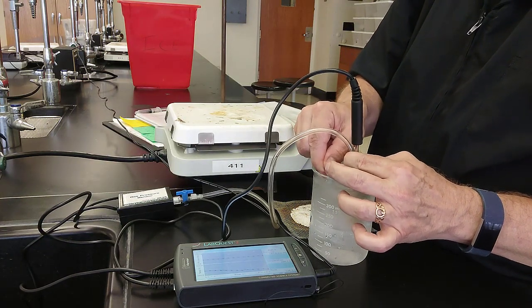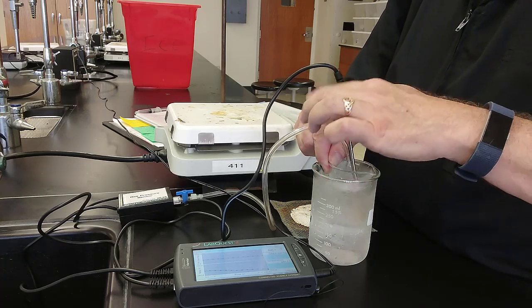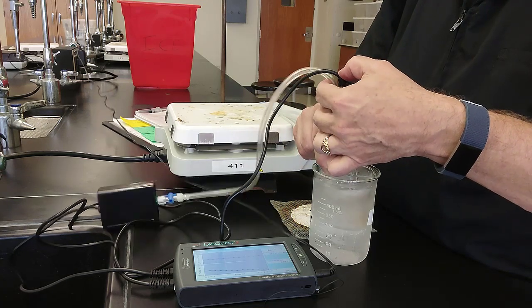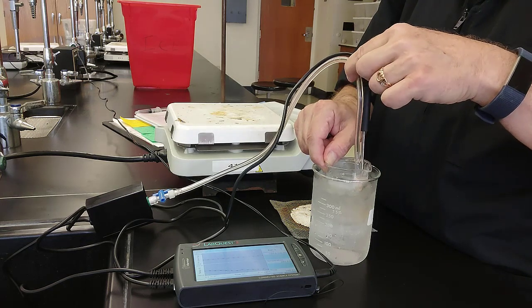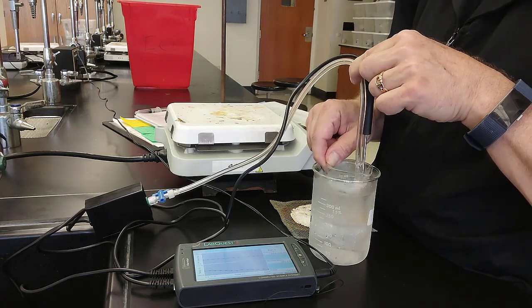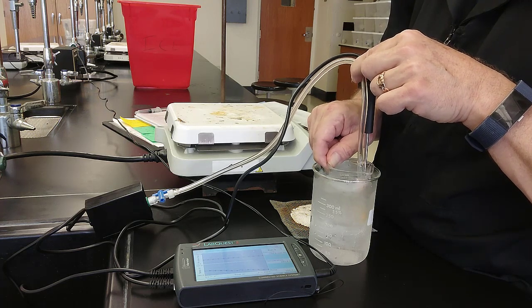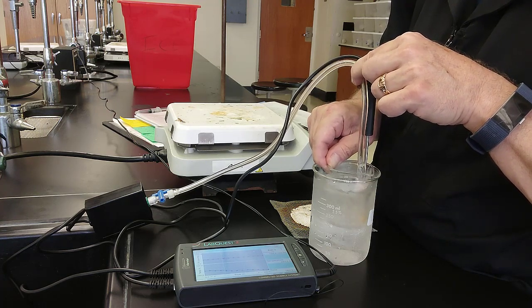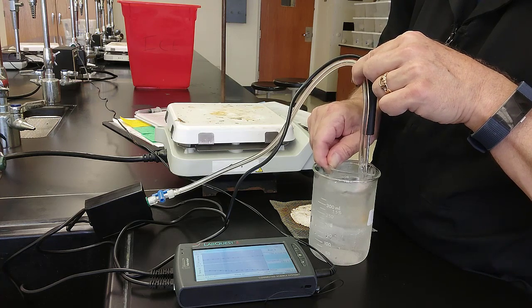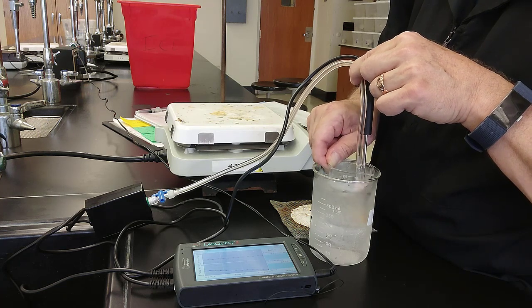Maybe I'll let go of the temperature sensor. Not a bad idea to hold the temperature sensor and the hose more up here rather than having my finger on the temperature sensor. Our temperature is now at 283.6 and our pressure has dropped to 746.6. We're a little over 2 minutes. At 3 minutes, I'm just going to say we've seen enough, and I'm going to switch to the hot plate.